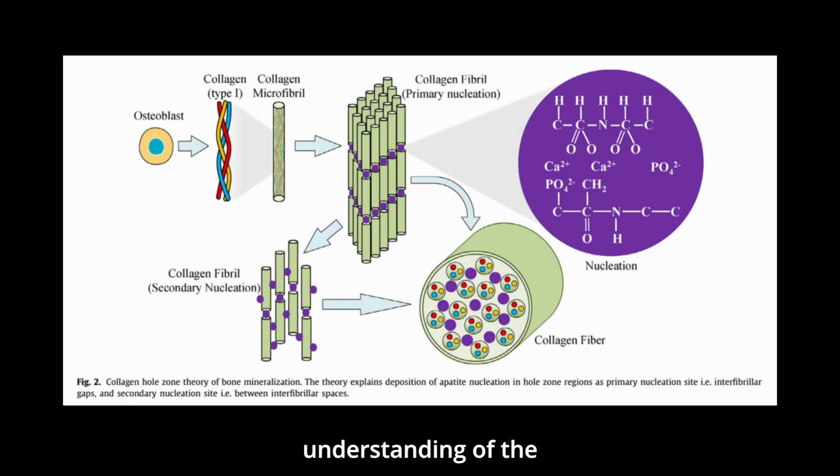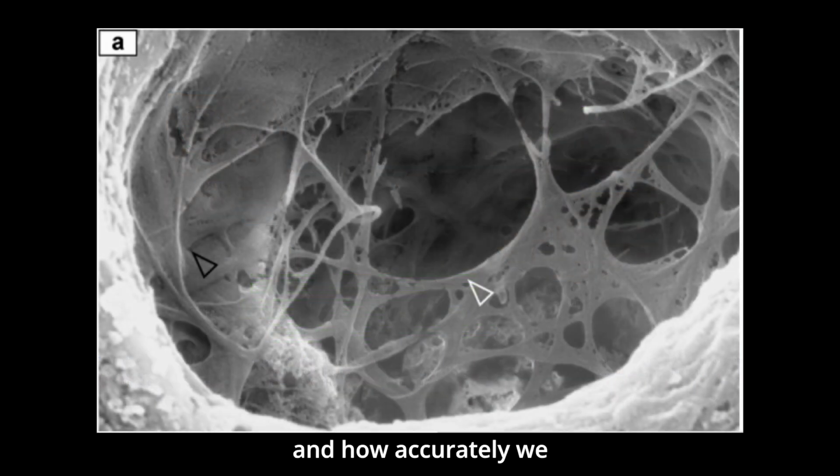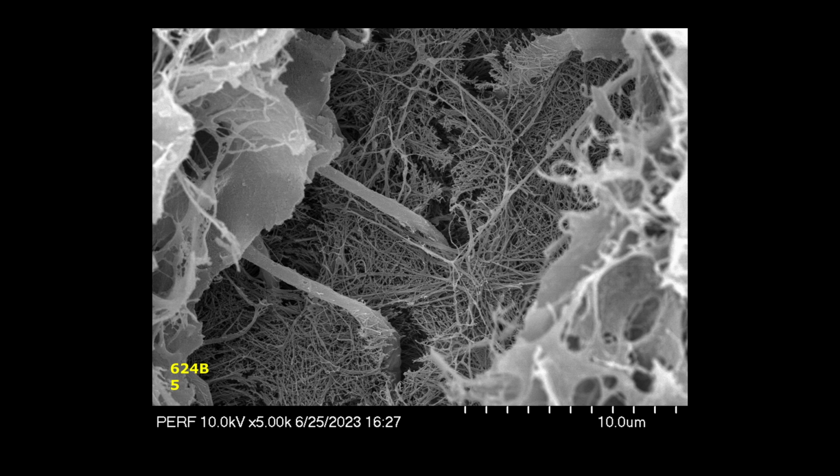and to make sure we had a good understanding of the steps in that process, because it affects the lens through which we experience image perception and how accurately we interpret SEM images. Without that background, we would make many errors in analysis.